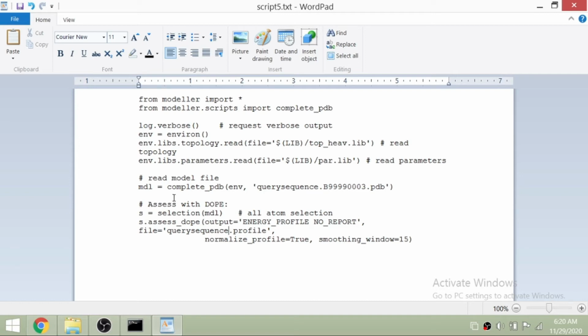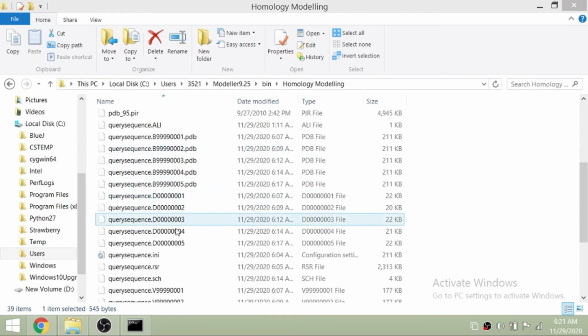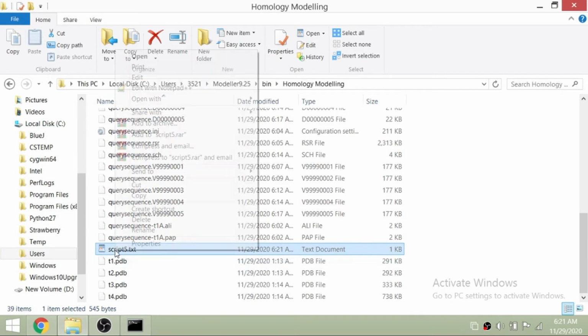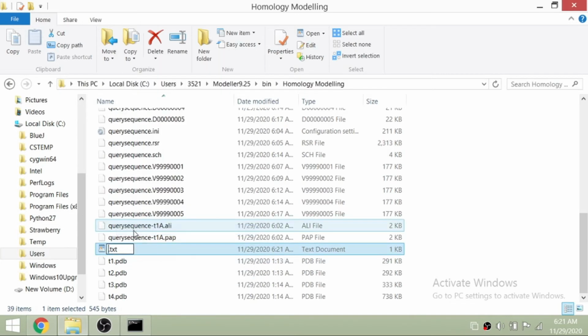Now these things are almost done, and just checking that all the things are correct. Okay, everything is fine. Okay, complete underscore this and everything. Yeah, these all things are already available. You don't have to change much from the script file. You just have to change the names, and then you save it and rename it as evaluate.py, as we have talked about. Evaluate.